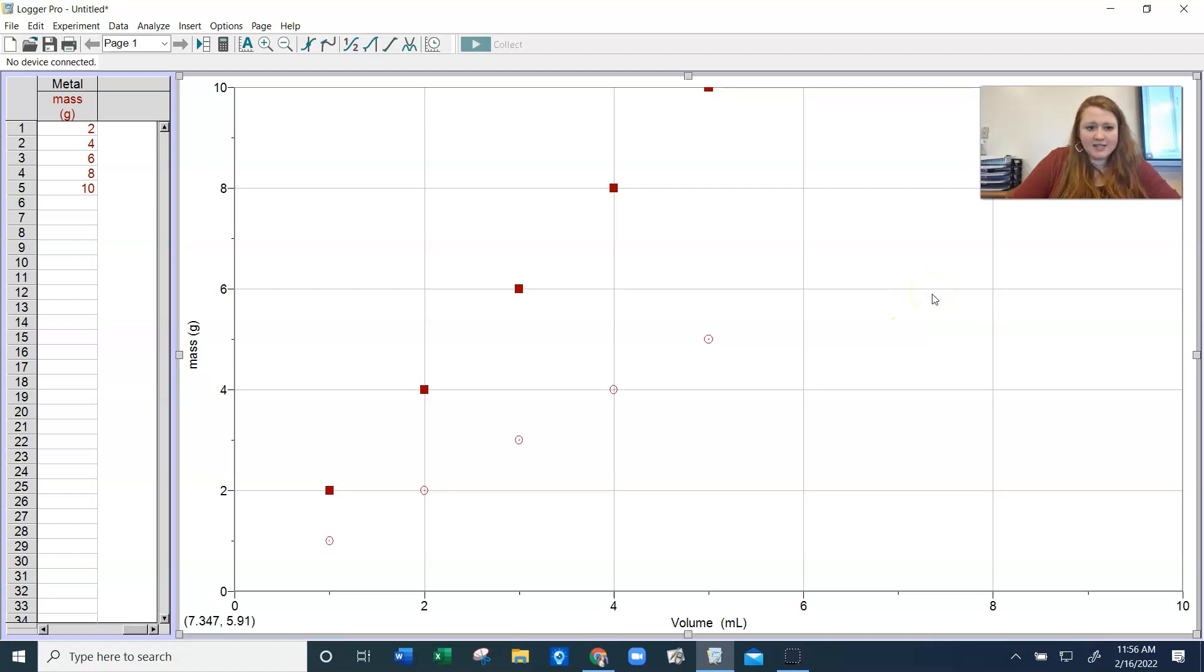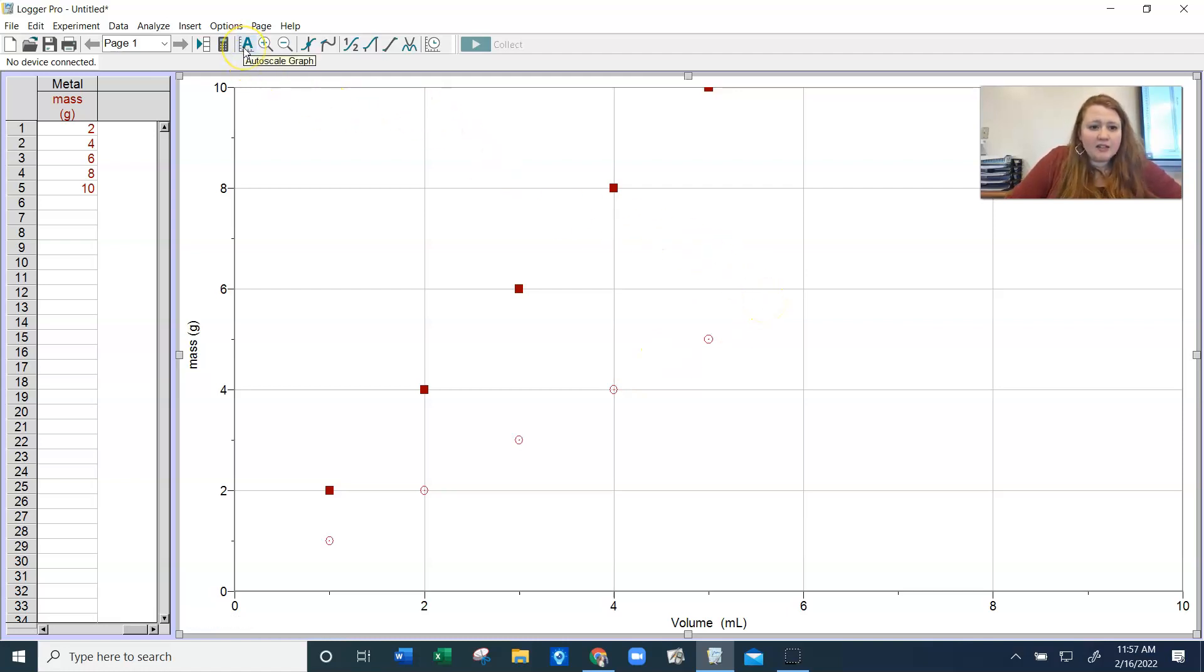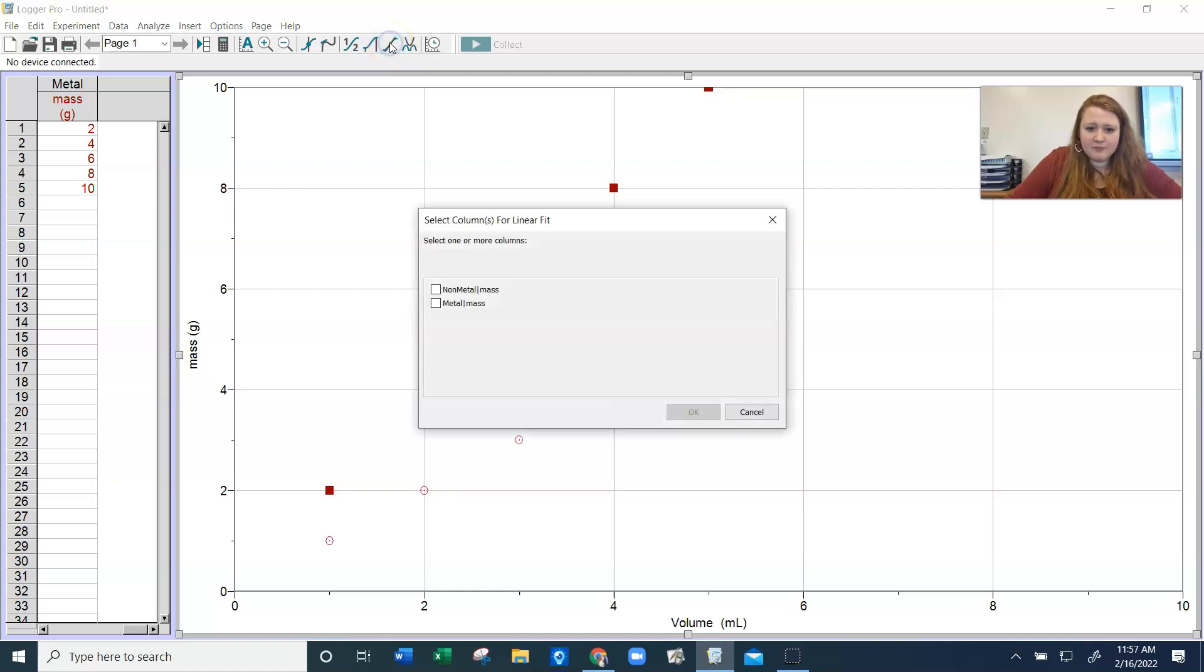Now, the very last thing you're going to do, once you have all of your data graphed on the same graph, you're going to come up here. And if you hold your cursor over these buttons, it tells you what's happening. We want to do a linear fit, which is this key right here. And we want to do a linear fit for our non-metal and our metal.